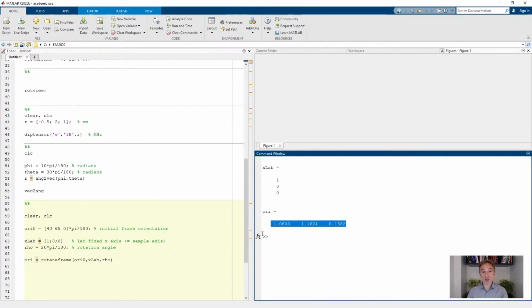So these are just some simple tools to handle orientations. Most of the time you don't have to use these tools directly if you just want to simulate something. But it's important to be aware that they exist, and especially the new visualizer allows you to get a better feel of what these angles actually mean. So this concludes the session on orientation and coordinate frames. I encourage you to look in particular at the documentation.